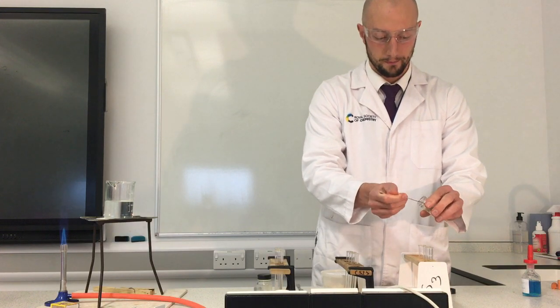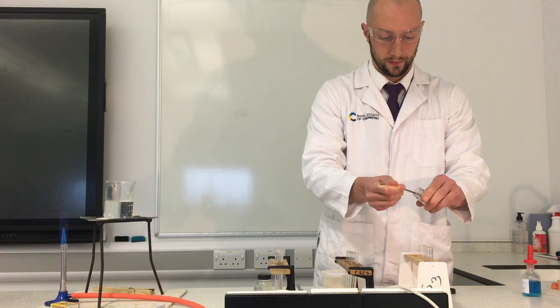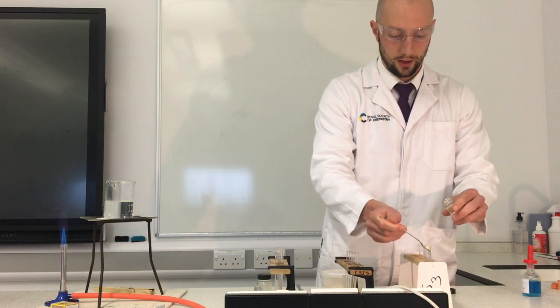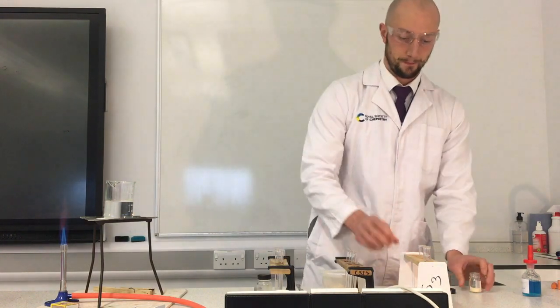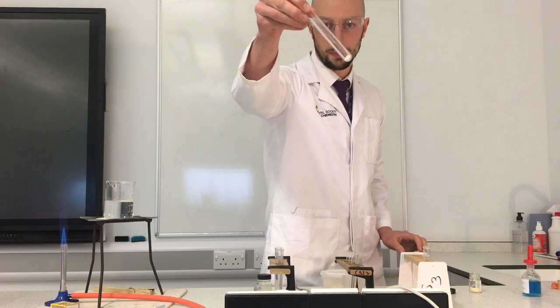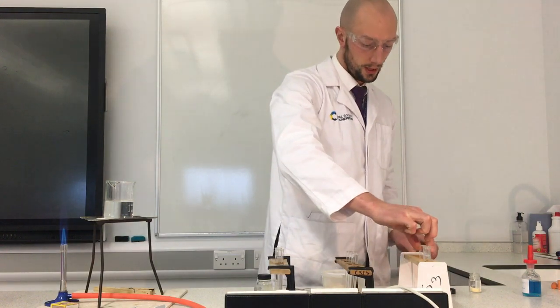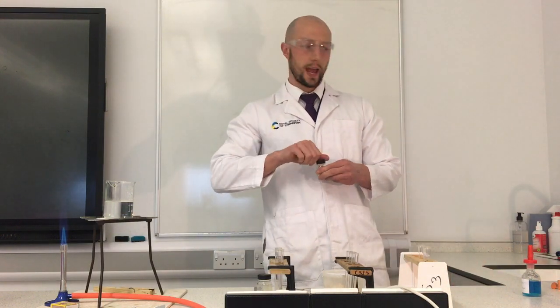That's 1, and 2, and 3. I have energy drink in my 3 test tubes. There we go, that's what it looks like. There's a bit of energy drink powder in the bottom of each one. Now I need to test to see if each of the 3 nutrients is in my energy drink.